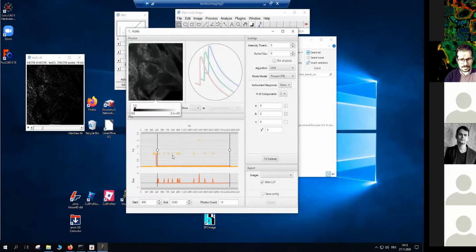And just open it. Oh no, the time base, I did it wrong. It's not 12.5, it was another value. I see that it's going to some weird numbers, a few hundred nanoseconds or so. I'm just shortly calculating that. So it's 256 channels, that's the histogram depth that we have, and we are acquiring 12.5 nanoseconds. That's our data.